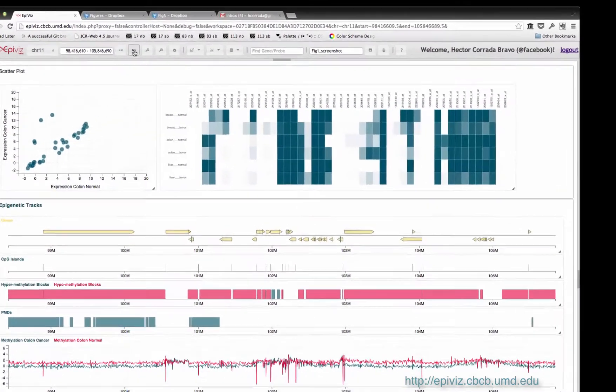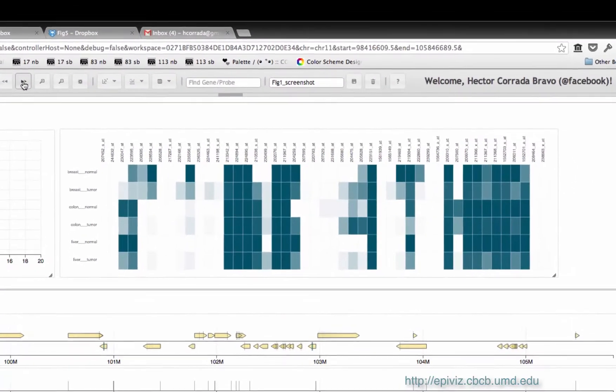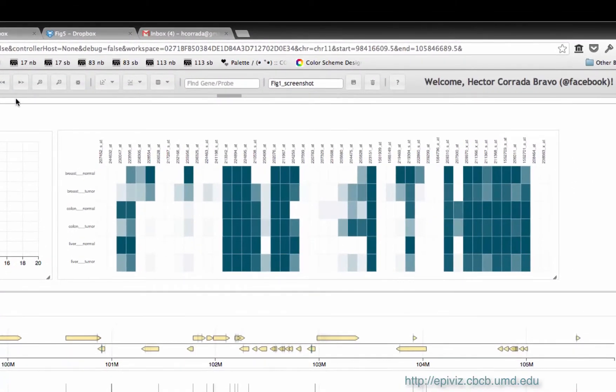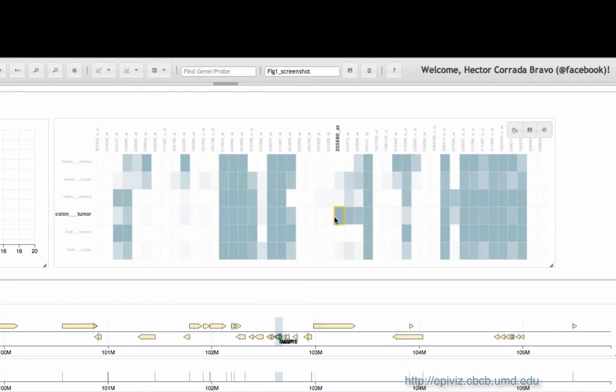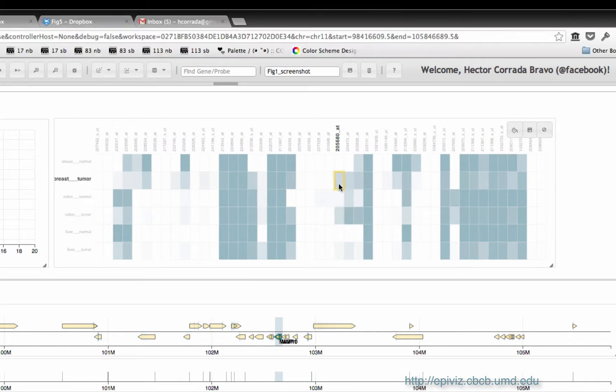We have also made data from the gene expression barcode available. We can see the expression pattern we observe in colon cancer in these hypomethylation regions also occurs in other cancer types.